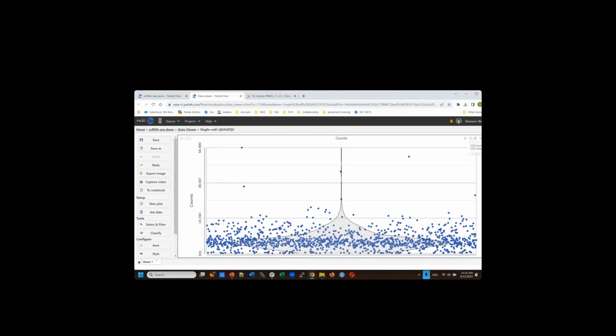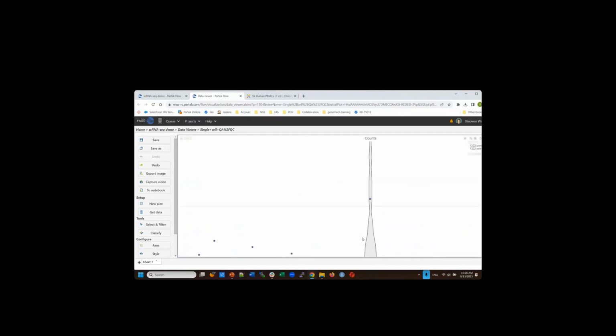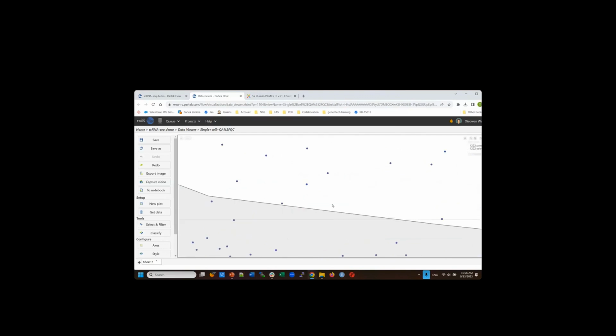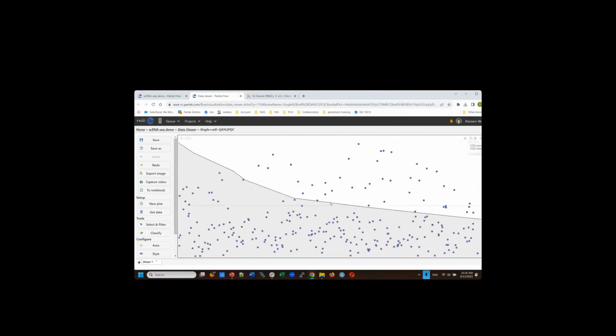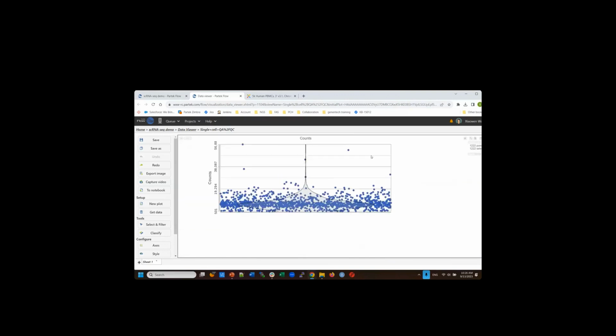If you scroll your mouse wheel in one direction, you can zoom in, and press down your right mouse button, you can pan to go to a different location and zoom in. Scroll your mouse wheel the other direction, you can zoom out. Okay.